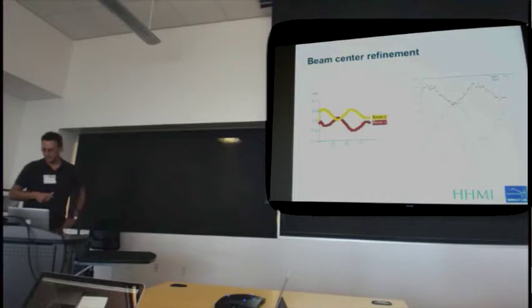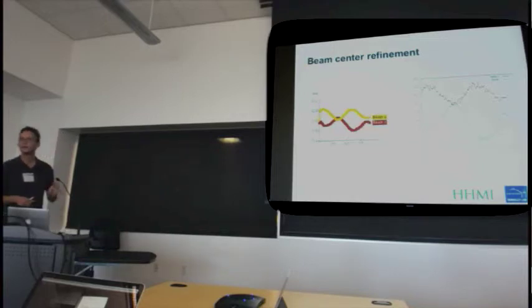Now, it does turn out that basically the same algorithms, or those ideas that we had in the beginning to determine the position of the quadrants on the CSPAD, can be used to detect and correct for the movement of the beam center.